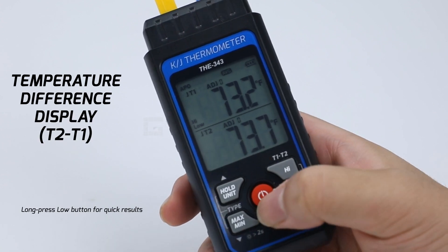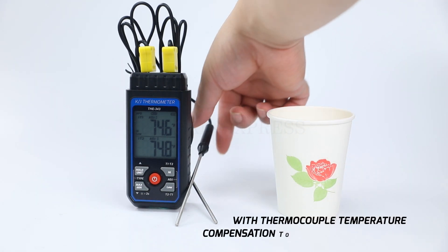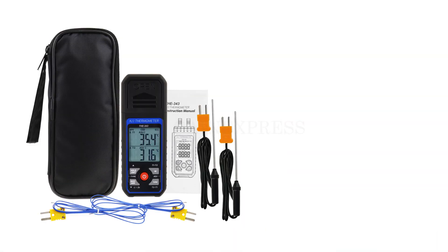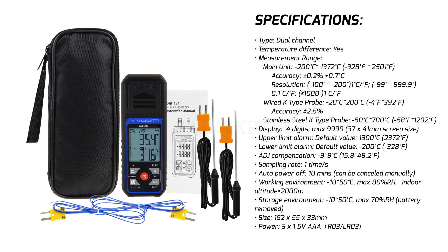Our thermometer features thermocouple temperature compensation for optimized test accuracy. Experience precision, flexibility, and reliability with the KJ thermocouple thermometer.